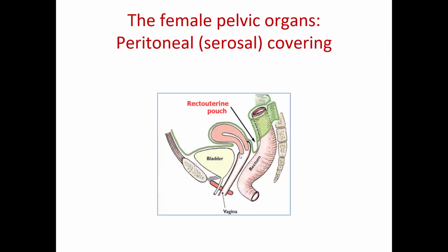So one cut is going to go here, where they will separate the cervix from the septum between the cervix and the bladder. So the knife will go here, cutting the serosa, cutting this soft tissue, and cutting this vagina. Posteriorly, this cut will go here. So it cuts the vagina and very little in terms of serosa.